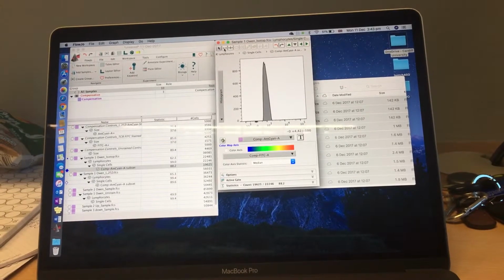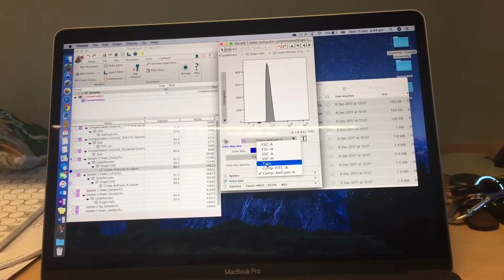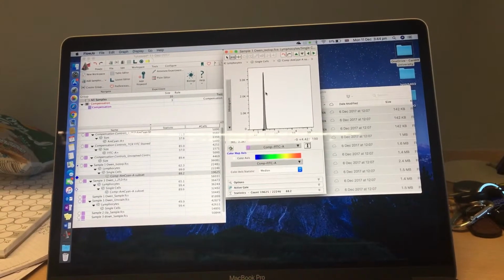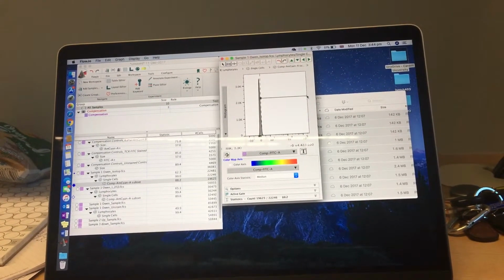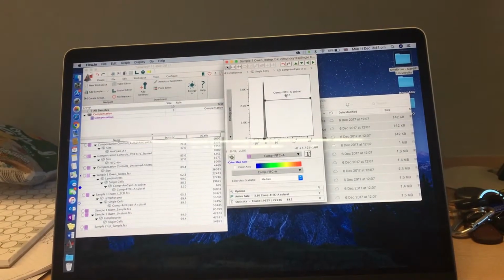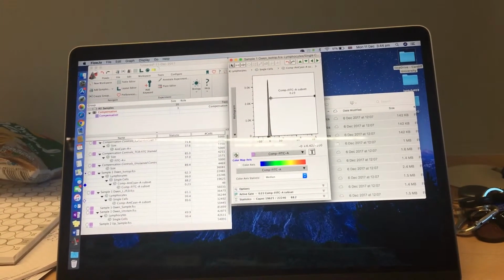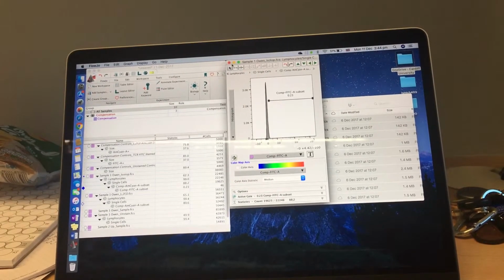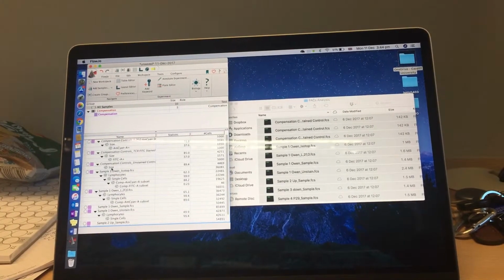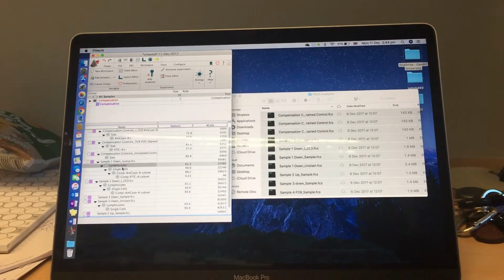Okay, and now change it to FITC, TCR. FITC. And now gate negatively. Move it so it's a 0. That's fine. It has to be 0 point something. Okay. And now highlight all those four. Understand the isotype, right? So those populations there.